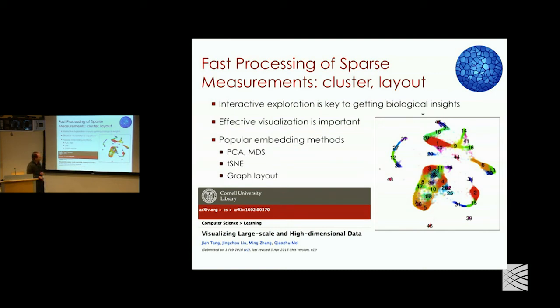It's a little bit less stable than TSNE, to be honest. There are a few knobs and whistles to tune, but generally speaking, with a reasonable set of parameters, it's able to visualize clusters reasonably well. I think the only concern we had is it tends to stretch out some of these clusters, but I think this has to do with the PCA, with the embedding, right? Sorry, with the reduction. Please? Right, so the complexity, again, there's no guarantees here because it depends on the sparsity of the graph and so on.